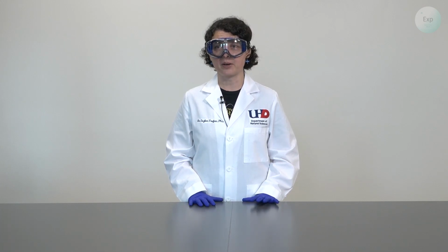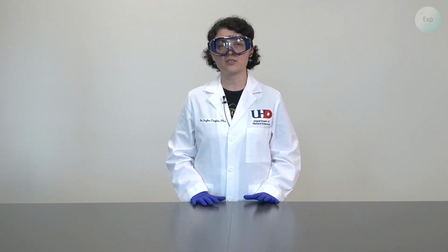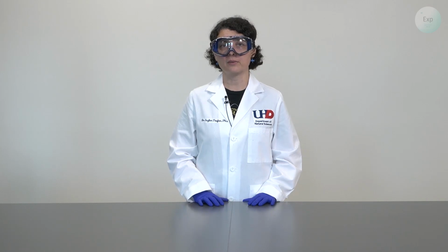My name is Dr. Esther Trufan, and in this video, I'm going to demonstrate another way of performing your kinetics experiment. This time, we're going to lower the concentration of our bleach inside the solution by half, and we're going to fill the remainder of that volume with deionized water.